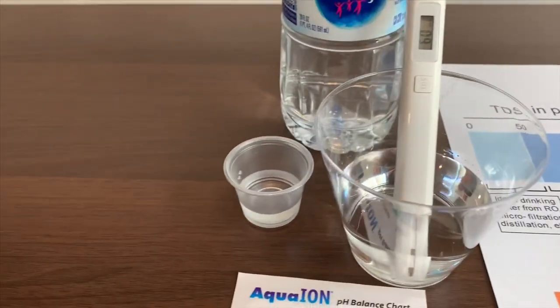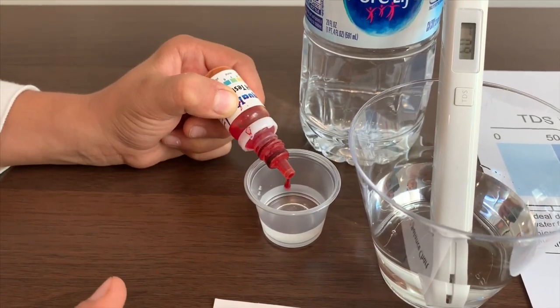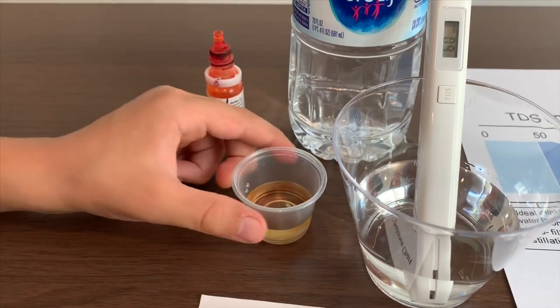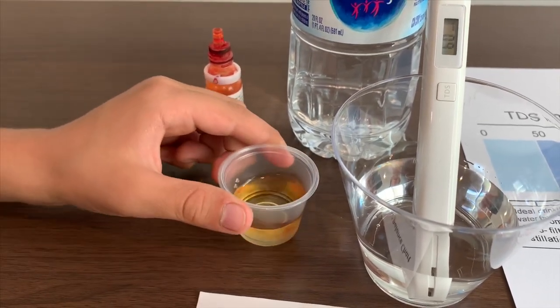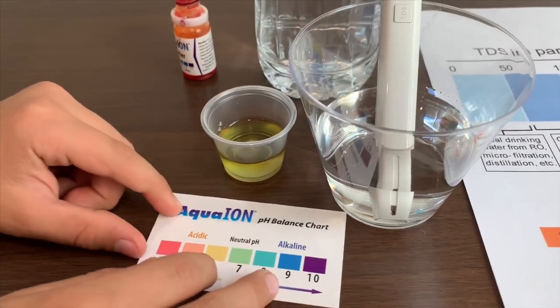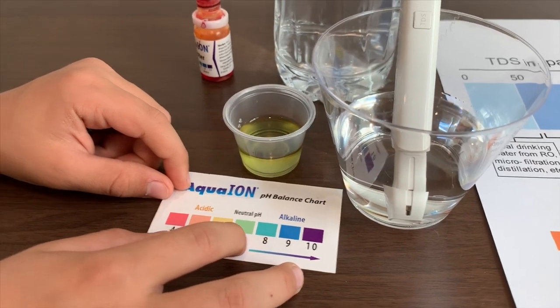Now let's test the pH. This is seven, that means it is neutral pH.